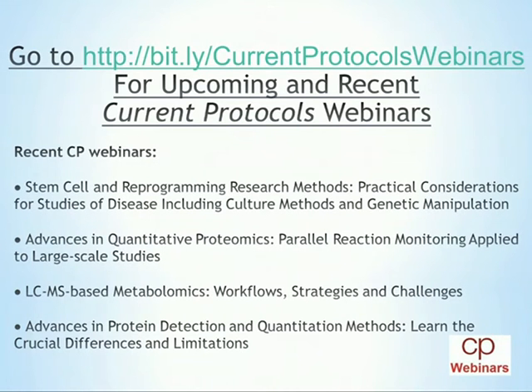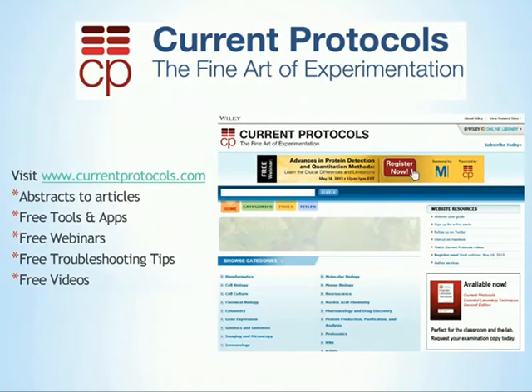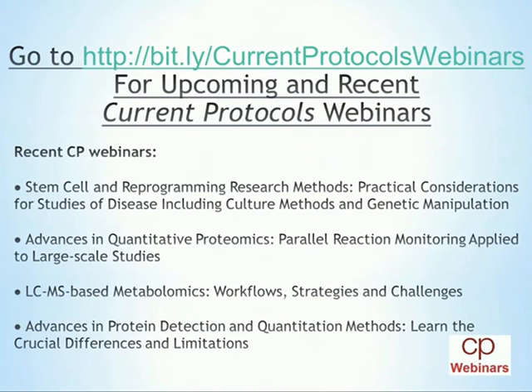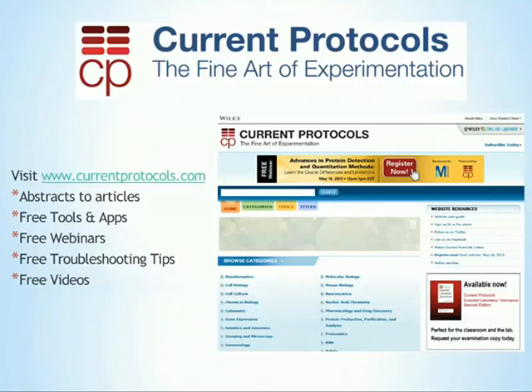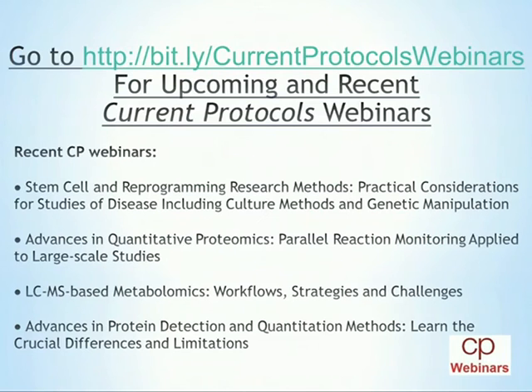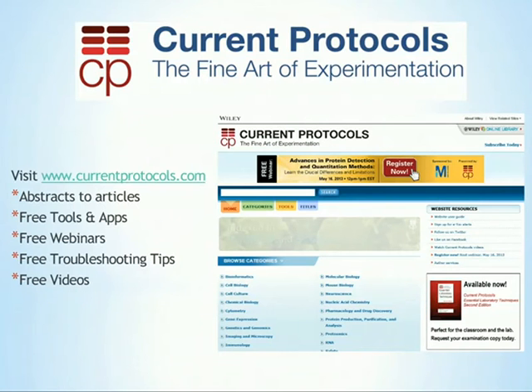We've found a couple of software packages that work pretty well, very flexible for entering your calibration curve, finding the linear range, taking a whole set of unknown data, your sample data, and converting them to concentrations. One is from Hitachi. I think it's called a multiplex analysis tool from Hitachi Software, and that's the one we use. I'd recommend that. There are a few other software tools out there for that purpose.